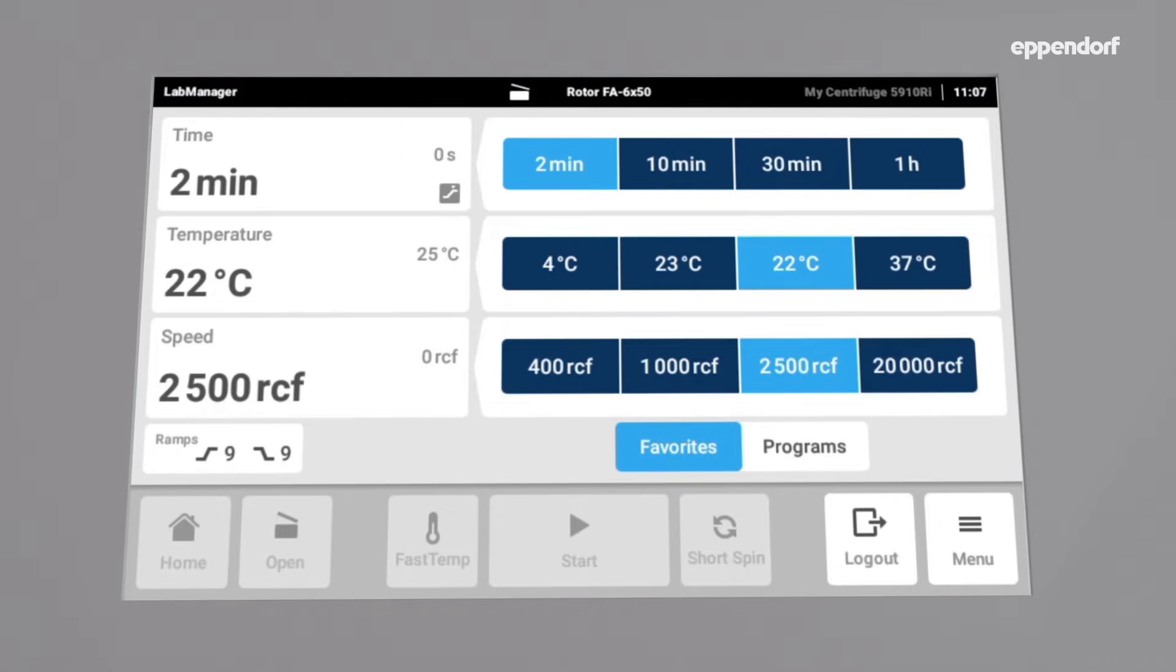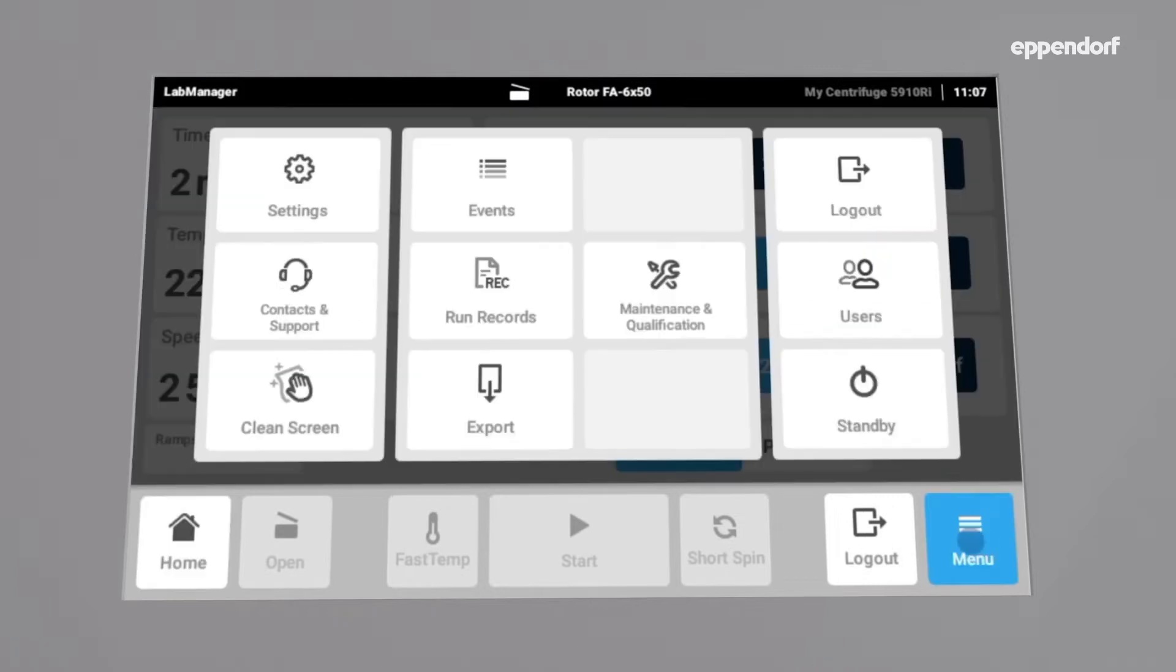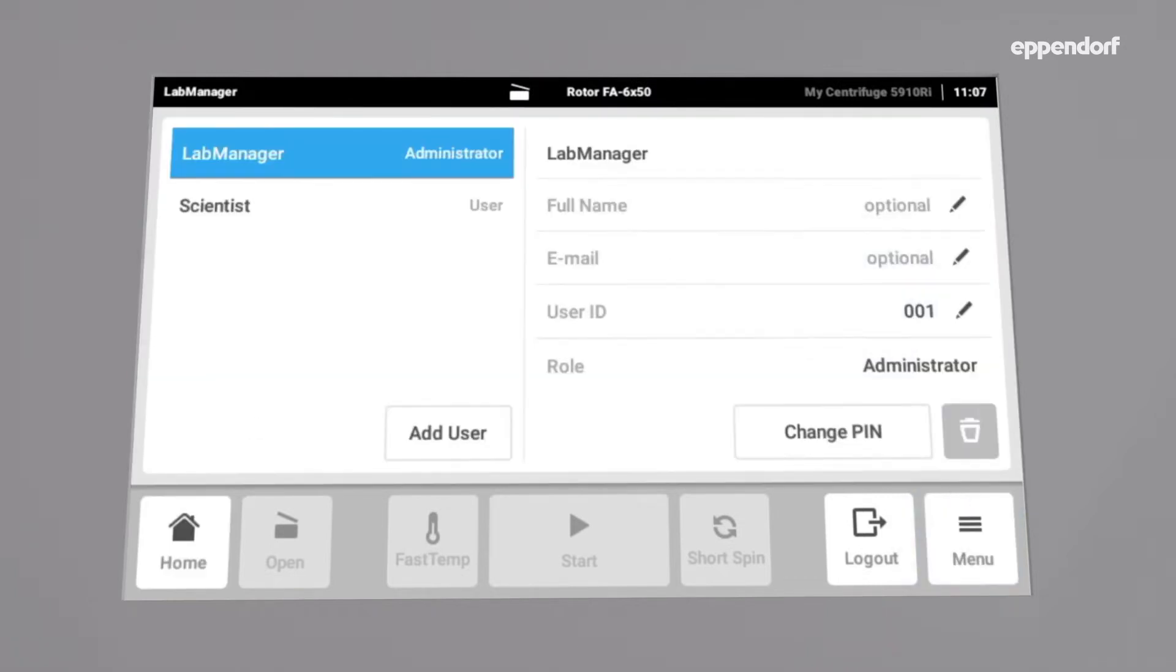To edit the user management, for example creating a new user, open the menu and tap Users. Here you can see that two users are already available.